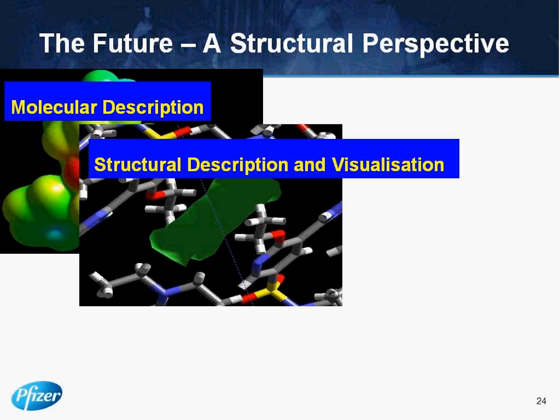From a regulatory perspective, I'm sure two questions: the probability of new polymorphs appearing and the impact of those new polymorphs. So those are the two key decision points of ICH Q6A. And what I've hopefully done in this presentation, and I'll try and answer your questions as well, is take you through some emerging tools.